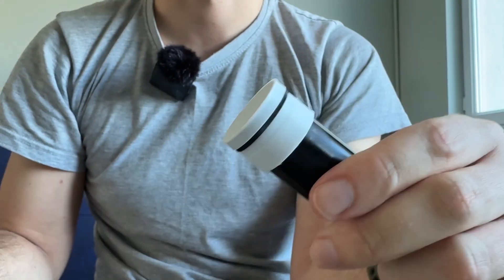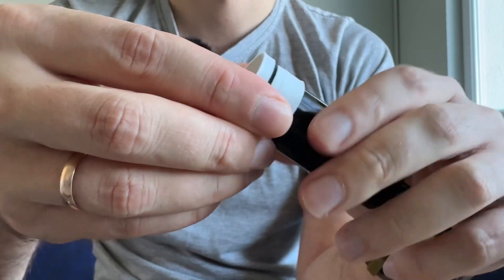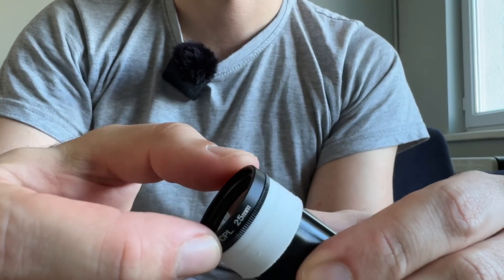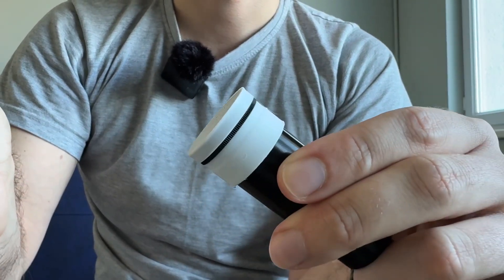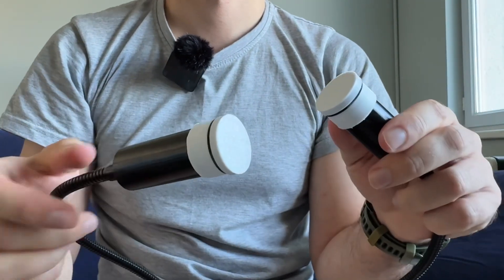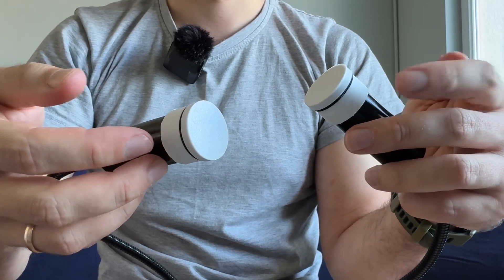And I even have protection for it. So as a result we have this one. Simply check — rotate, check. That's all. And we need 2 filters for 2 lights.